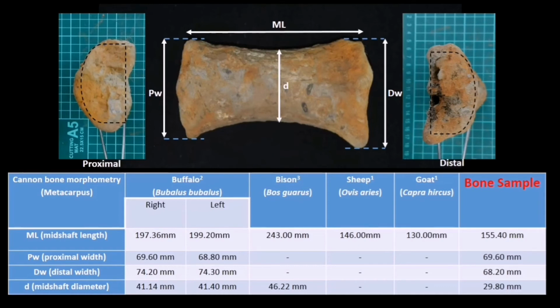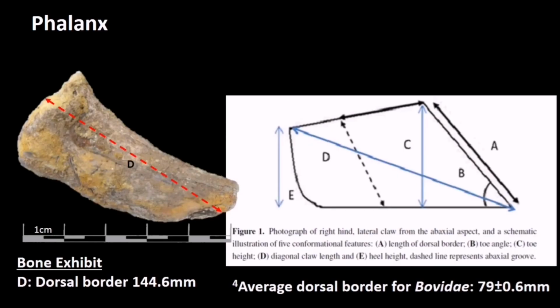At this point, I don't know how old the cattle was. I can't tell by the limb bone itself. Probably this is a malnourished old cow or cattle, or probably this is a 2-year-old cow. Who knows? Okay, phalanx. This is the sample of hoof.